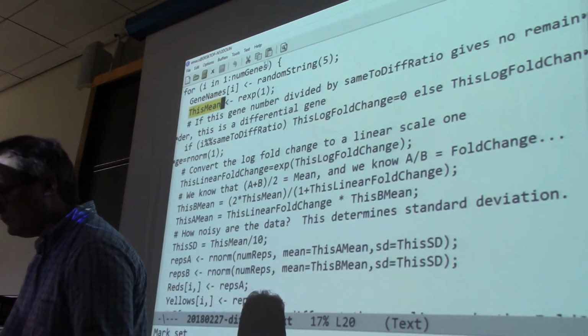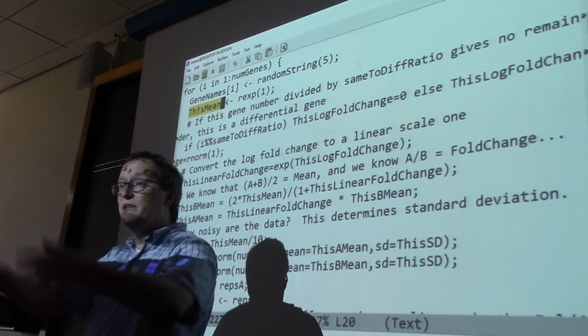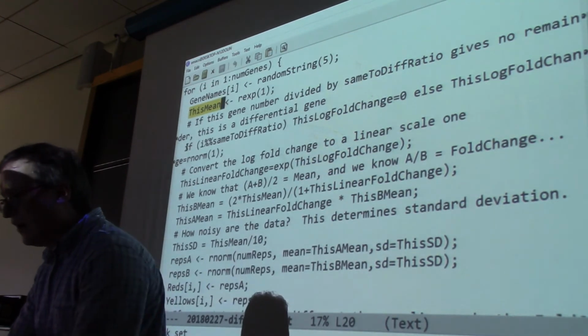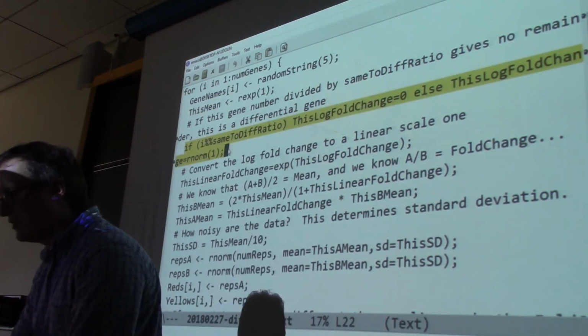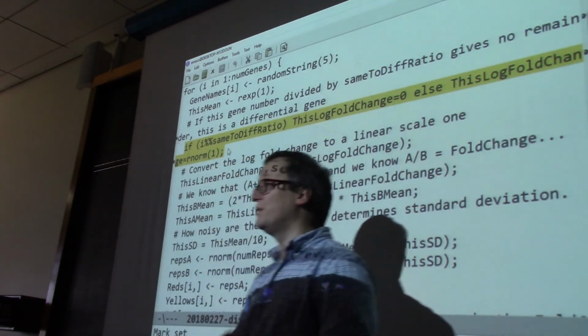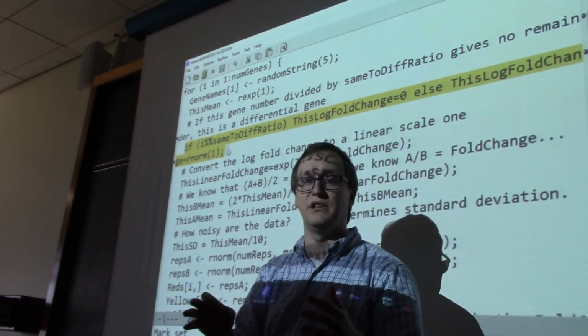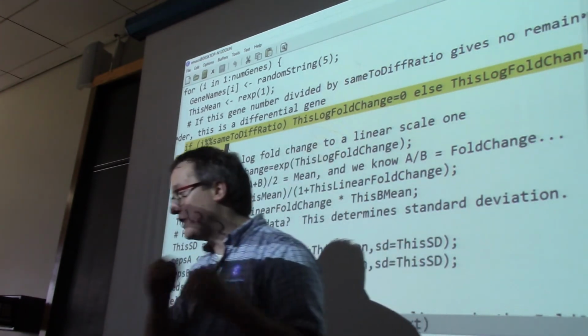Okay. So I'm having it randomly select what the value of that gene intensity will be. And now I've got some really wild math going on here. So remember, an if-then statement allows for us to do two different possibilities on the basis of a logical test.